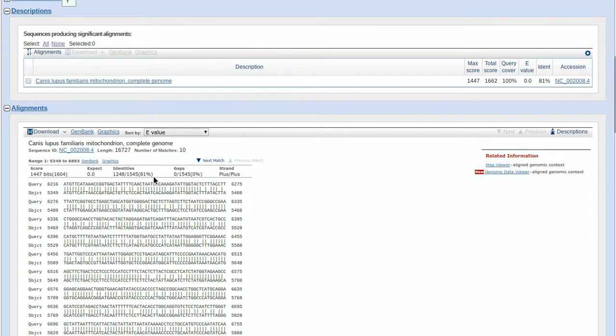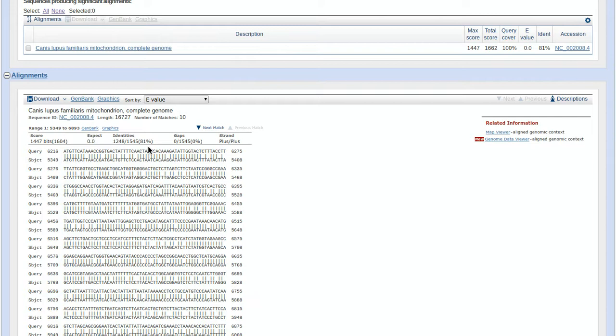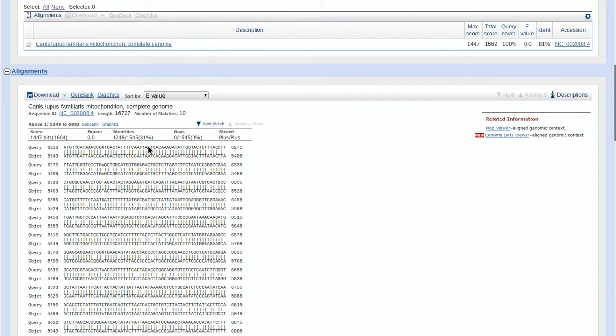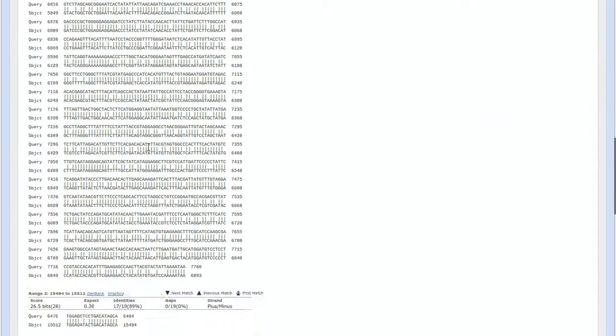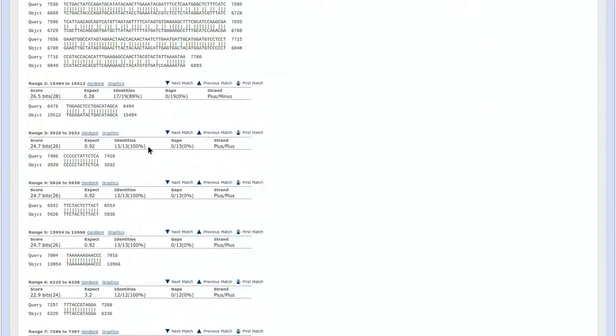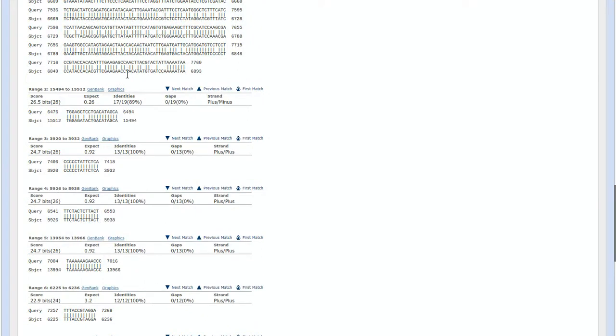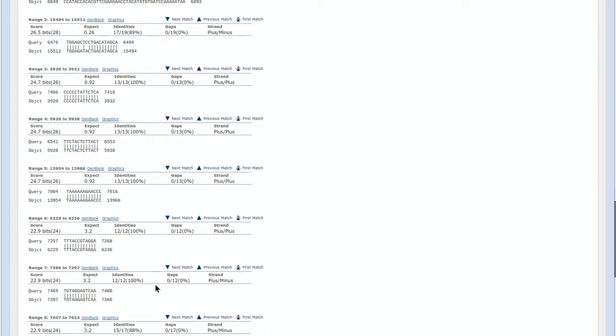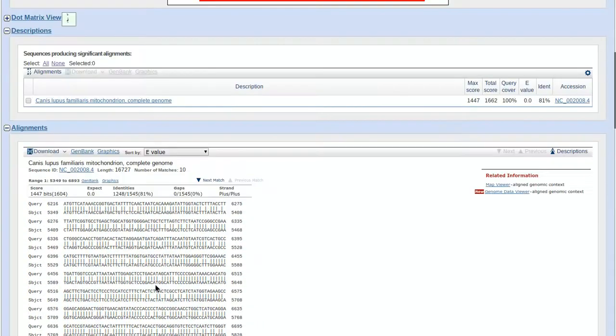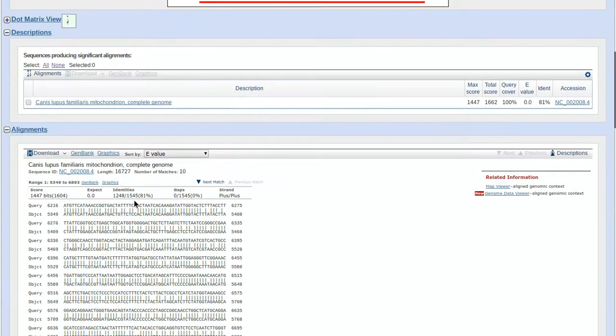So these are them aligned and this tells you the similarity. 81% similarity between cats and dogs. Cool, right? That's all you had to do. This breaks it down into different ranges, but here you go, 81% similarity.